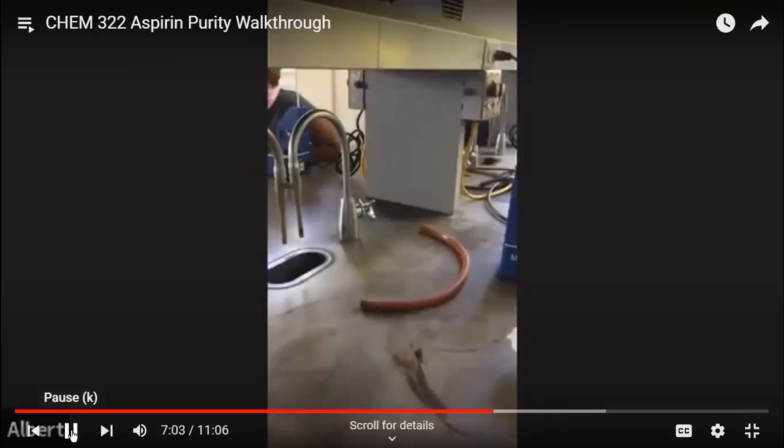You expect the crude to have the dark purple impurities, so it's not going to melt at 135. It should melt way before that because it's full of impurities. The more pure it is, the closer it's going to be to that 135 expected temperature that you looked up.